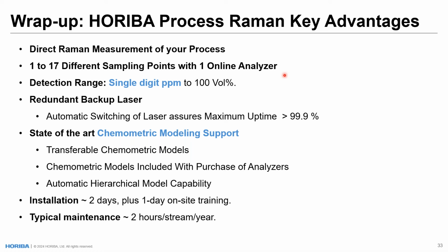All right. So the next question is which components can be measured with a Raman analyzer? I guess the question is how many components can we measure by using our system? Yeah, so for example, in a typical LPG stream or like in those gasoline model data table that I was showing before, we can measure up to several different parameters at once. That can be distillation temperatures, octane numbers, individual components and concentrations of those components, all within the same collection and model that can be applied to that Raman spectrum. So it's a multi-component analyzer per process stream.